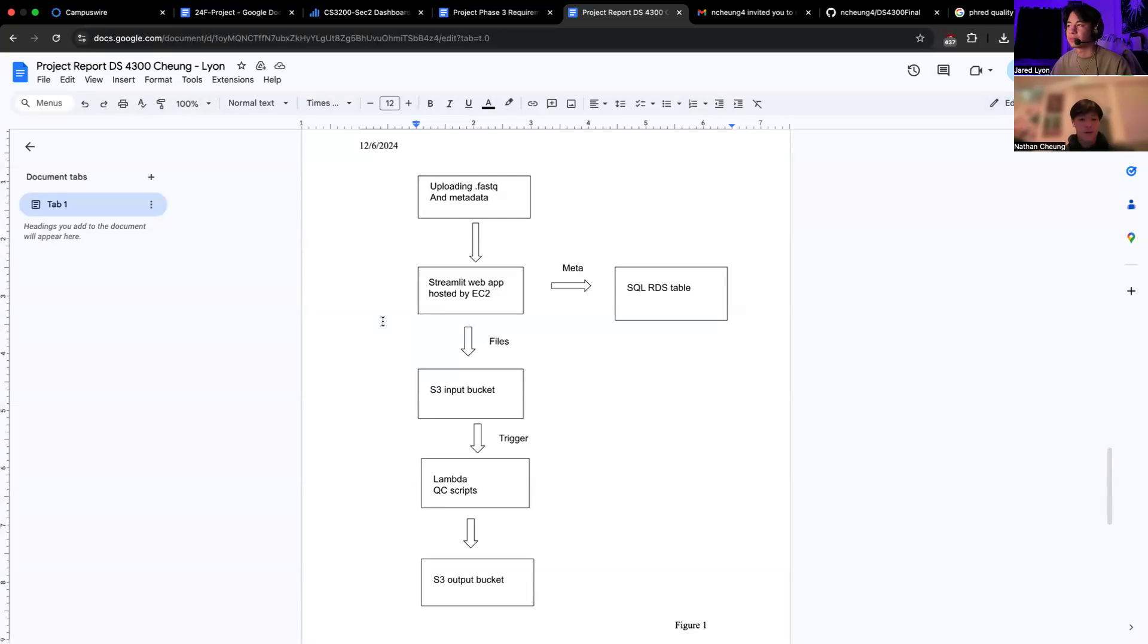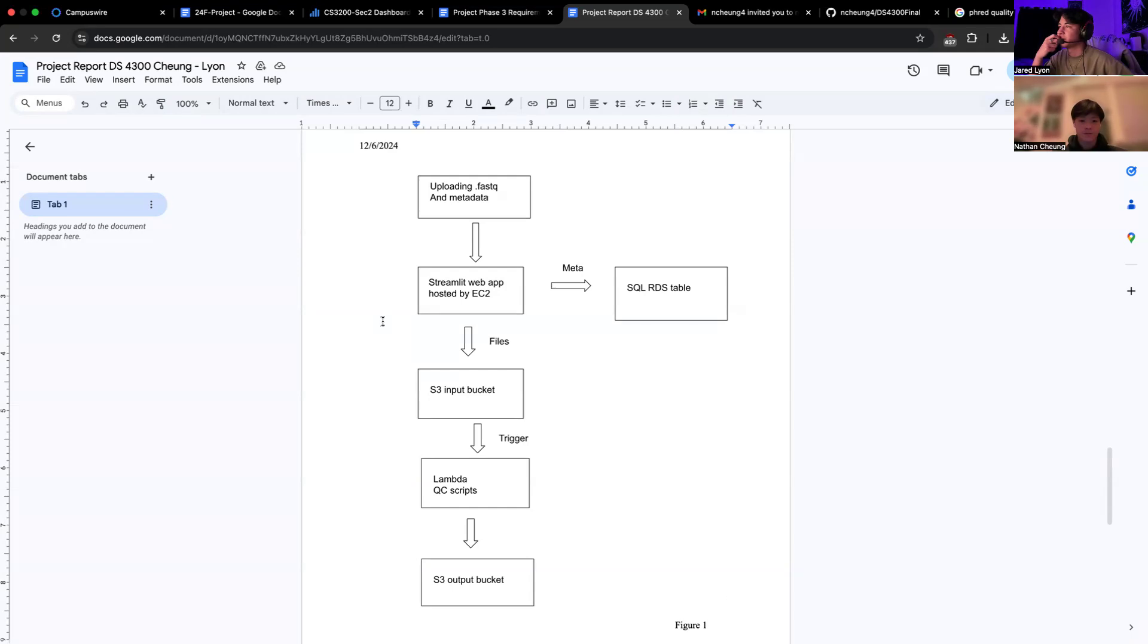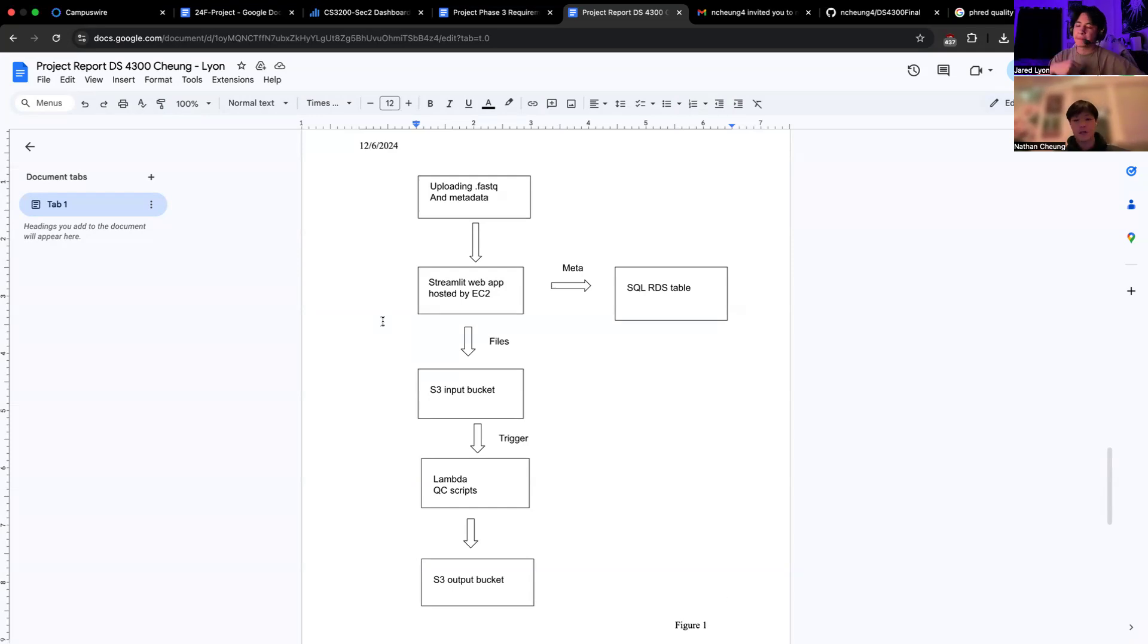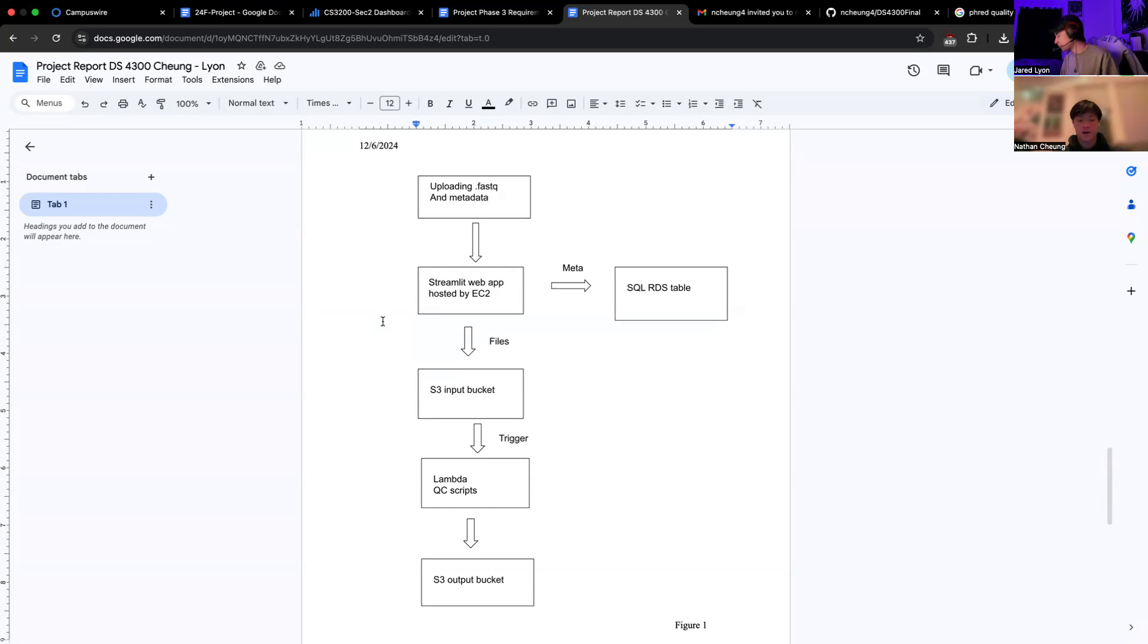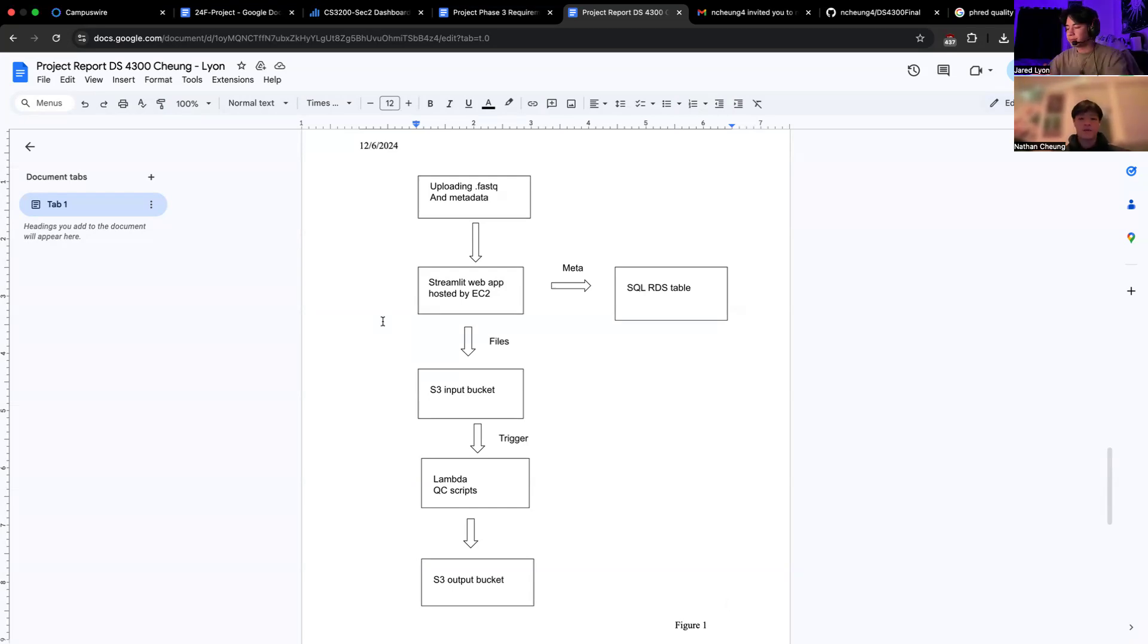Here's our routing map for a step-by-step flow of our pipeline. We first start with the user interaction via a web app using Streamlit, which is hosted on an EC2 instance, which serves as our entry point. The user can upload their FASTQ files directly through the app and input relevant metadata, such as sample ID and processing date.